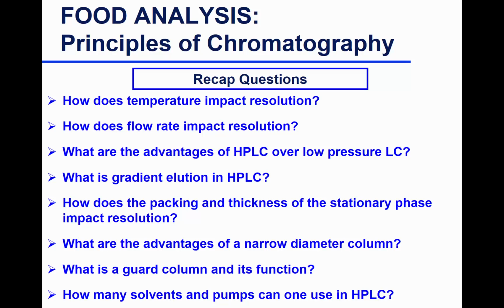And also the temperature, you don't want it to be too high because your column has certain thermal stability, you don't want to exceed that. You don't want it to be too hot or too high also with temperature where you don't get enough time to equilibrate. So we need to find optimal conditions so that we can get optimal resolution.